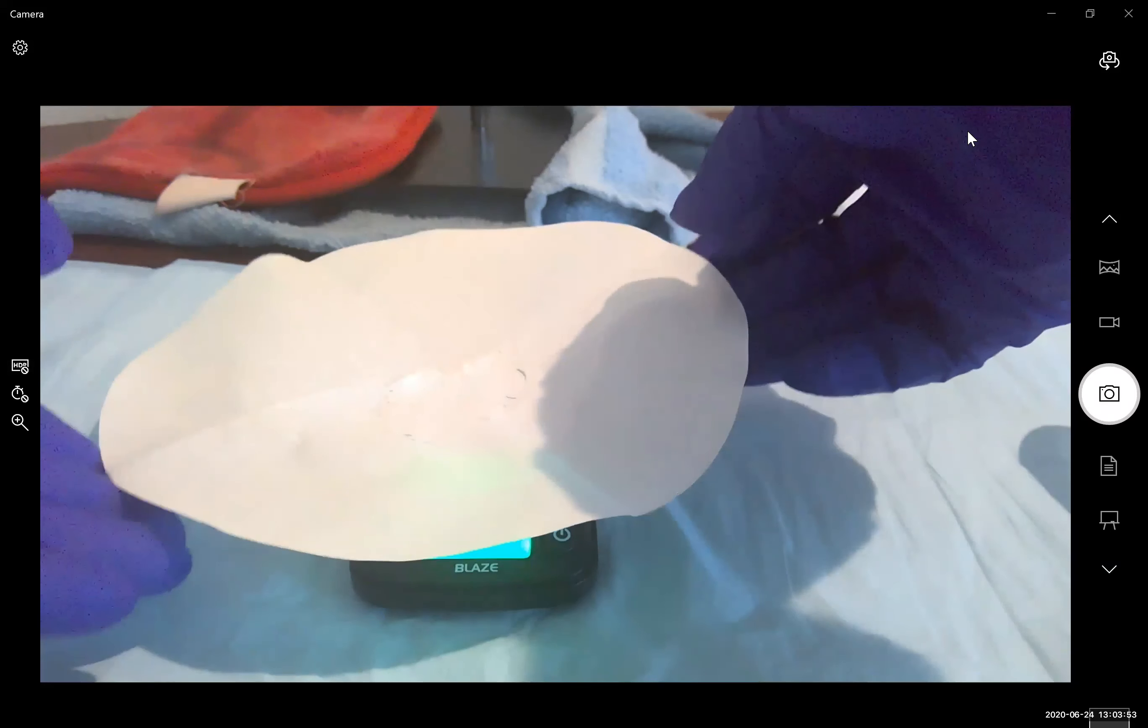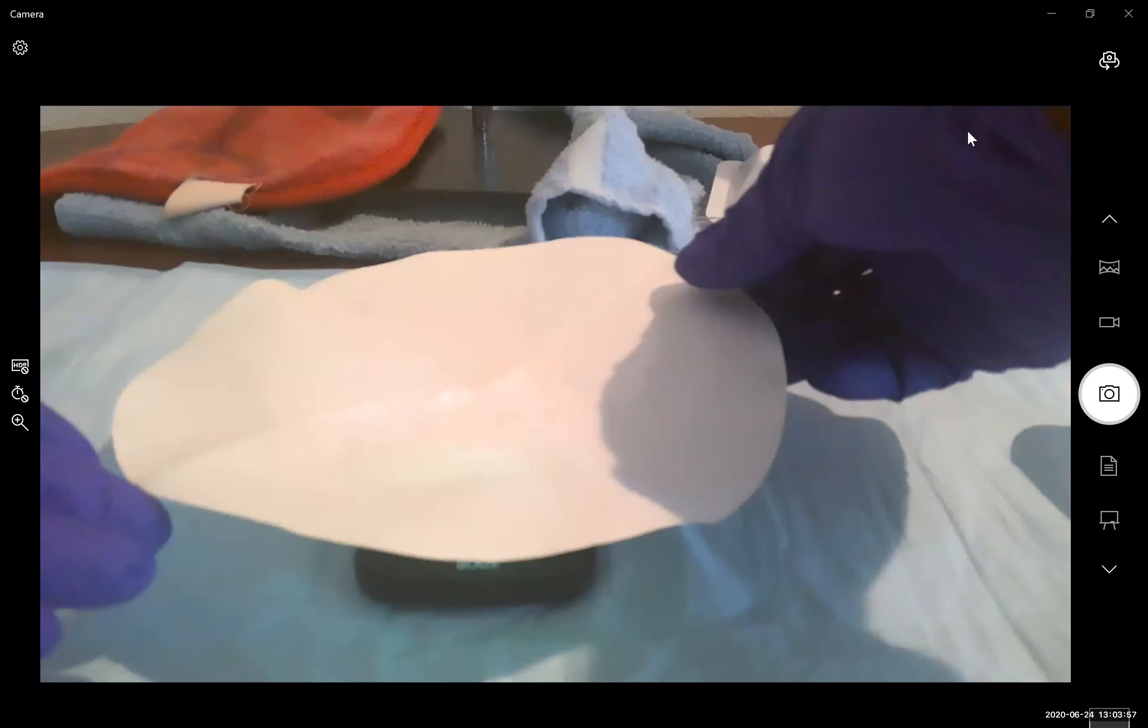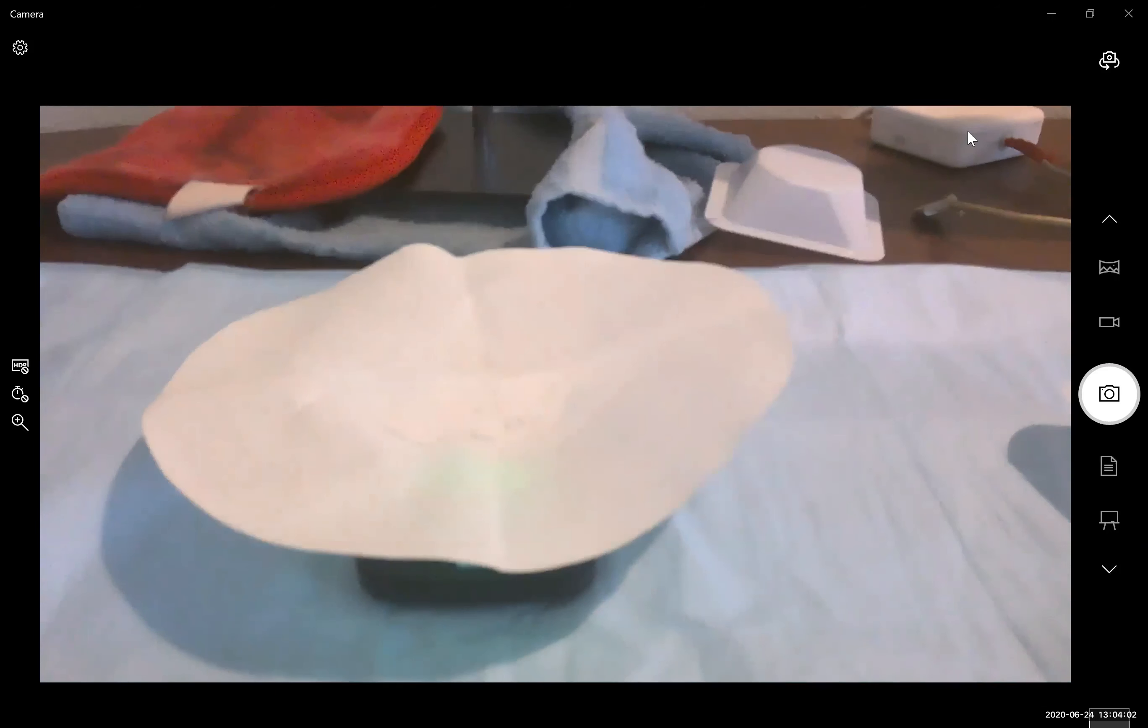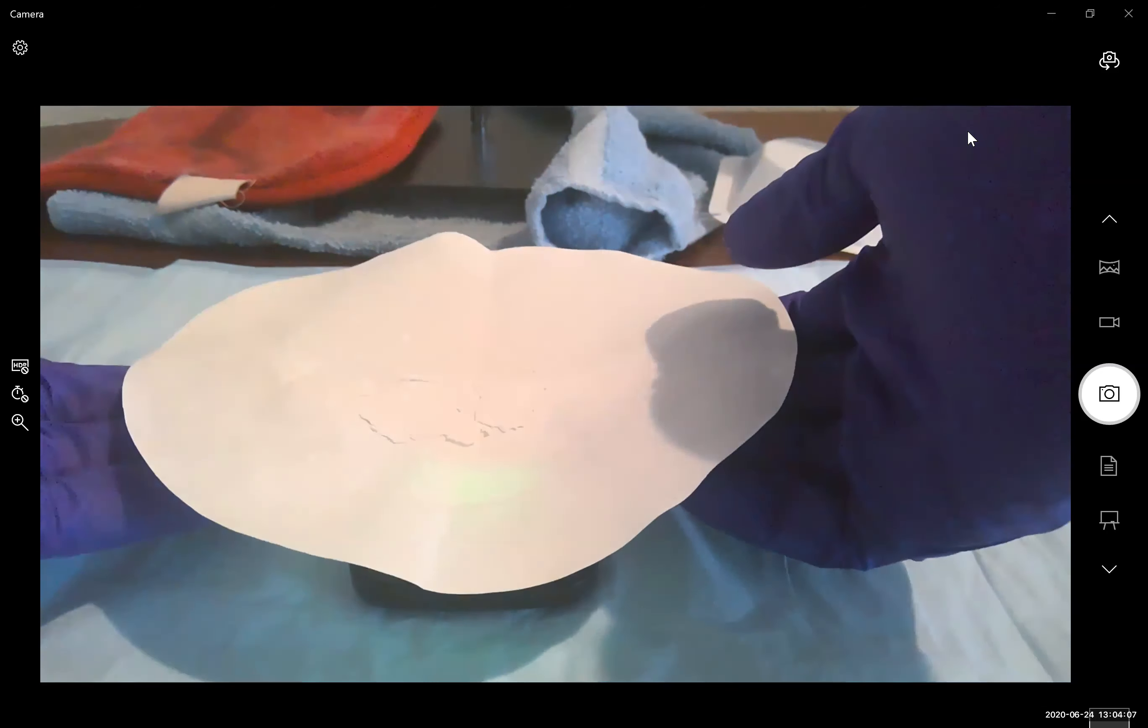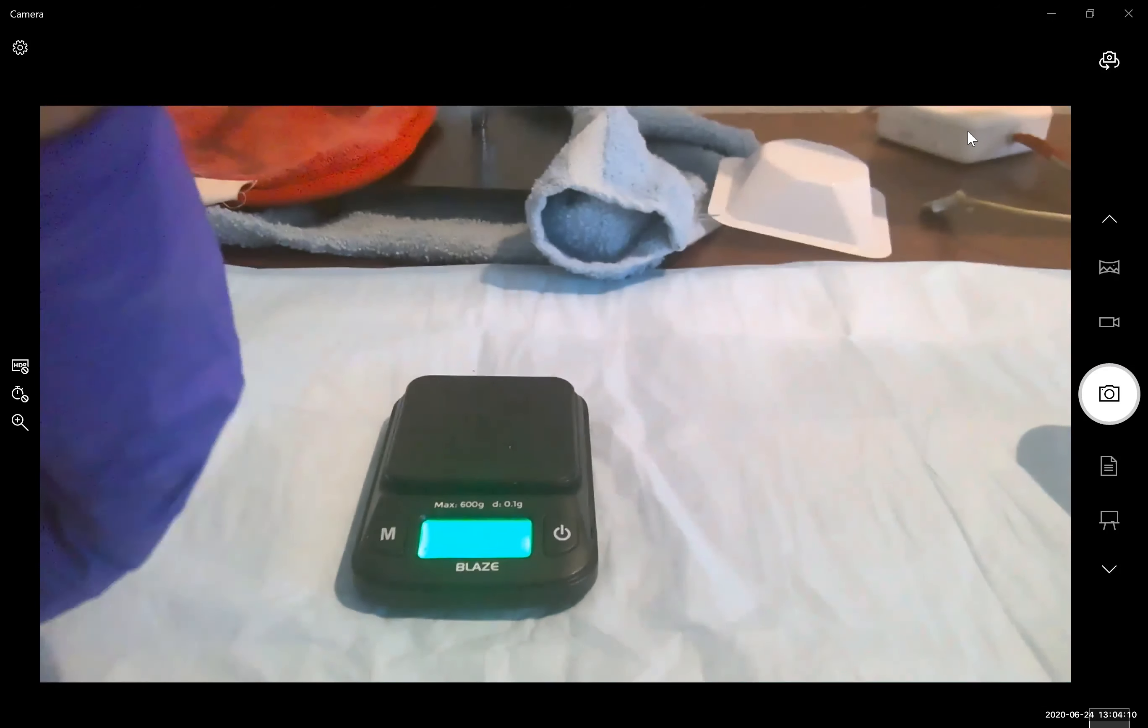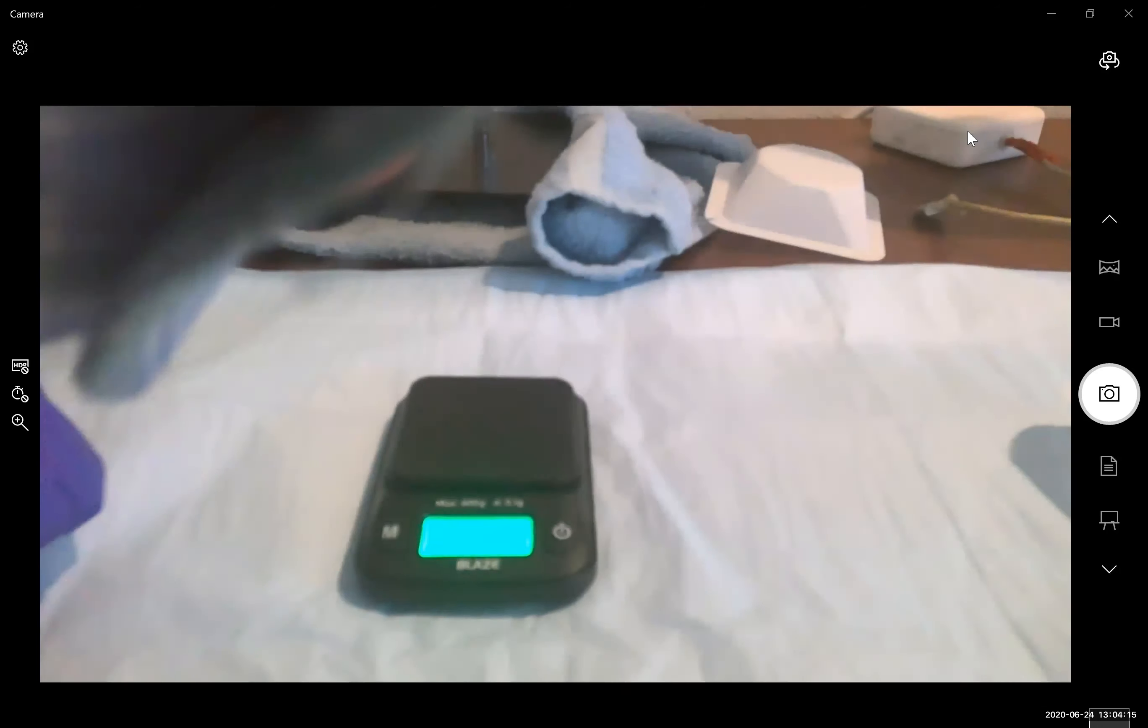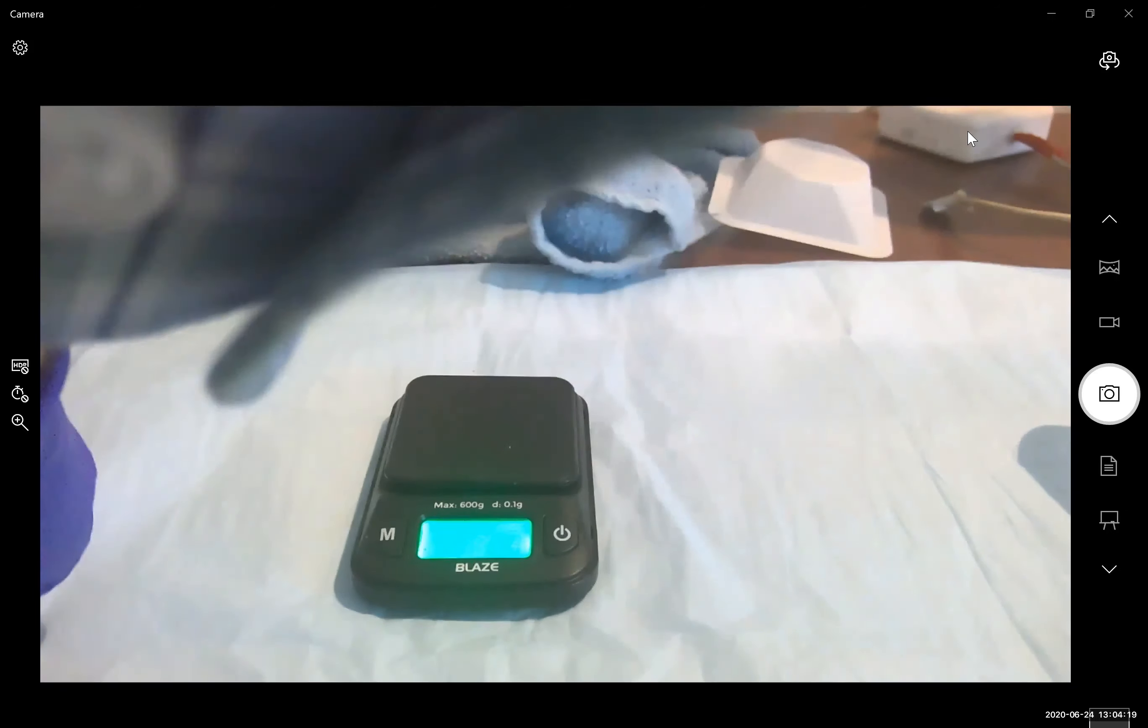I'm going to fold the weigh paper. Okay, let me fold the weigh paper up just to make it a little bit easier so that way we can see the balance a little more clearly.